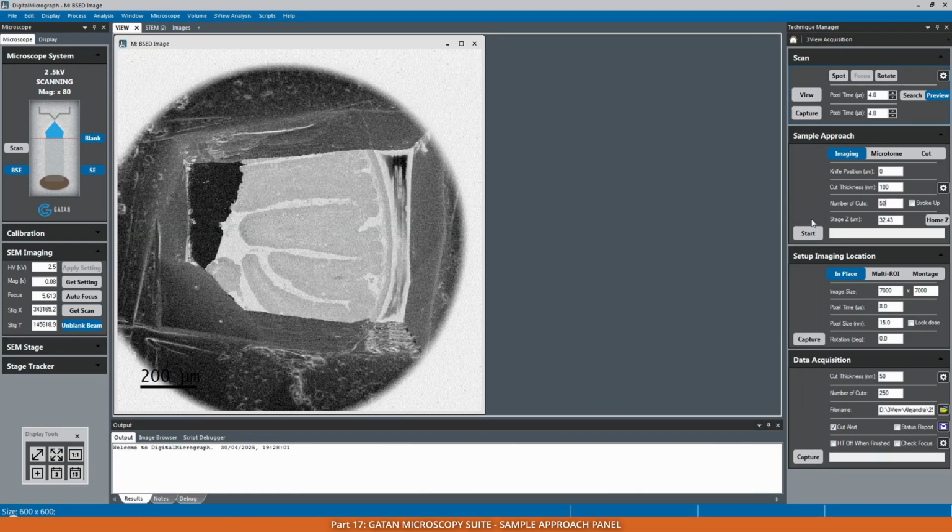And finally, as a warning, I showed that you can move the knife and you can actually see its position using the SEM beam, but I would not really recommend using it frequently. Because I think in that mode you can easily crash the program if the knife is moving and you're starting the beam at the same time.